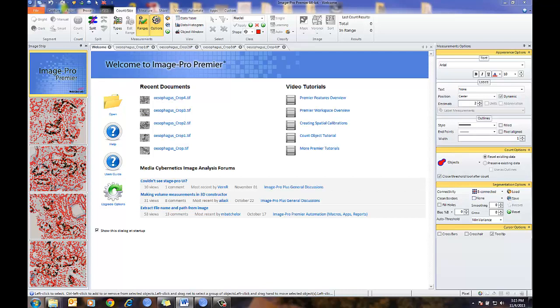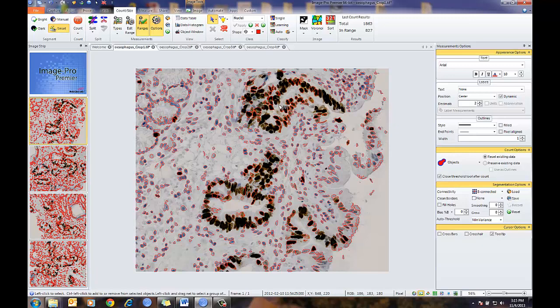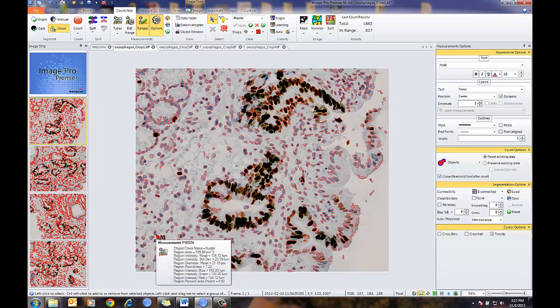I have a number of images; they're actually taken from some larger images. The nuclei we'd like to classify — I've already counted the objects, but the key here is I have the outlines of all my objects, in this case nuclei, and what I'm going to do is use these to build my learning classification, to build my training set.